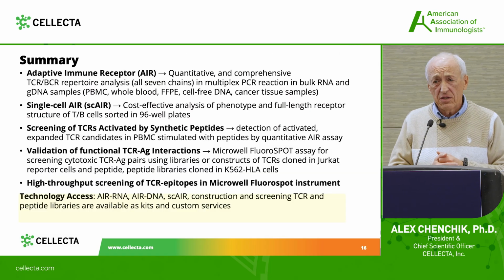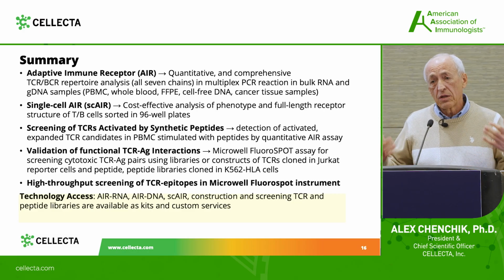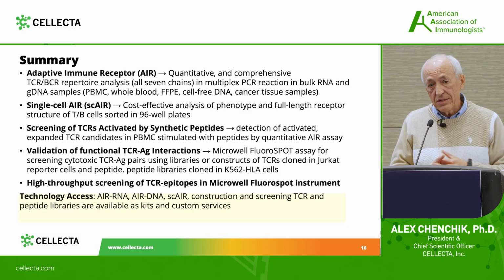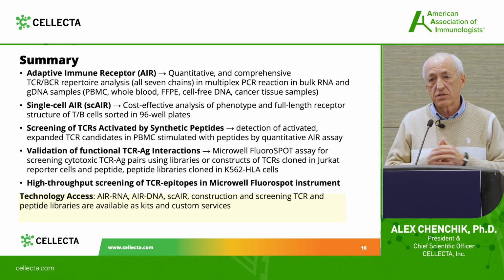And last slide, it's a summary of what we discussed today. We discussed the development of several technologies which allow you to facilitate this type of screening and some ideas about strategies for how these protocols can be used for large-scale screening of peptide libraries against T-cell receptor libraries.